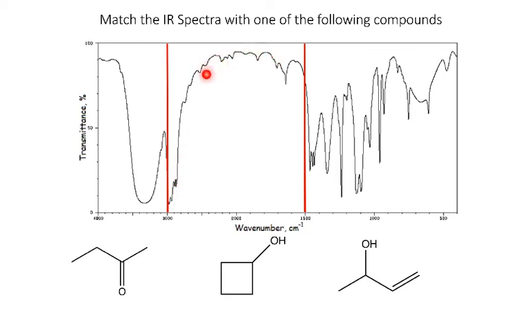What we're looking for in this region is double bonds at the lower frequencies, triple bonds at the higher frequencies, and then above 3000 wave numbers, we're looking for other hydrogen stretches. Typically, these are going to be oxygen-hydrogen, nitrogen-hydrogen, or sp2 hybridized CH stretches or sp hybridized CH stretches. I have a cheat sheet posted on D2L, which has the things that I'm looking for. I don't necessarily go in order when I'm trying to identify the different peaks.